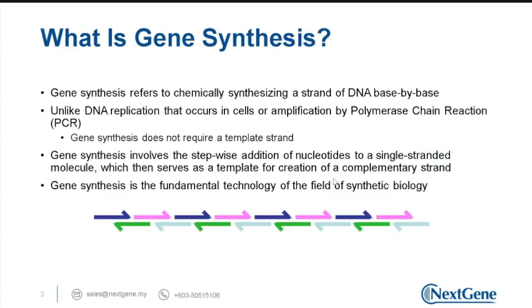Okay, so let's move on to the first agenda of today, which is what is gene synthesis. By definition, gene synthesis refers to chemically synthesizing a strand of DNA base by base. Unlike DNA replication that happens inside a living cell, or amplification inside a tube by using polymerase chain reaction, gene synthesis is a method or technology that does not require a template strand. So basically, it's considered de novo.